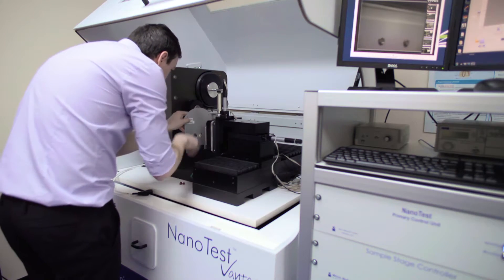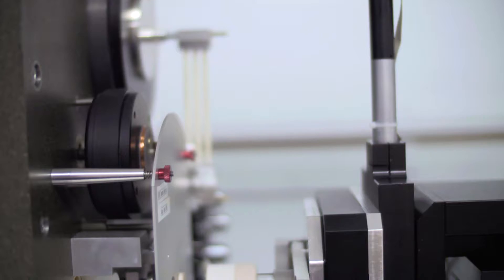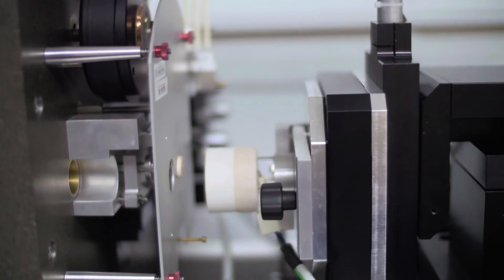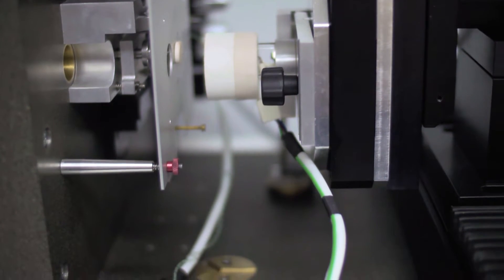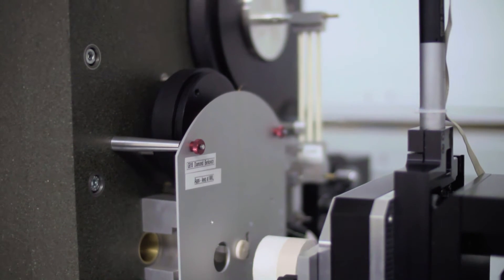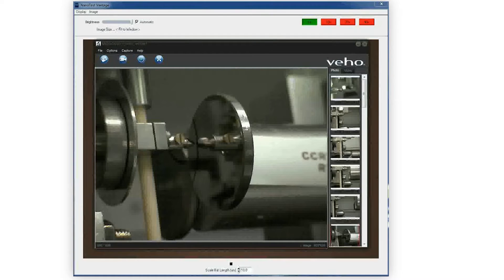The NanoTest Vantage offers industry-leading ultra-low thermal drift. This is achieved through a dedicated environmental enclosure with active temperature control and the high thermal mass of the instrument. This high thermal stability allows long-duration creep tests to be performed reliably and accurately.